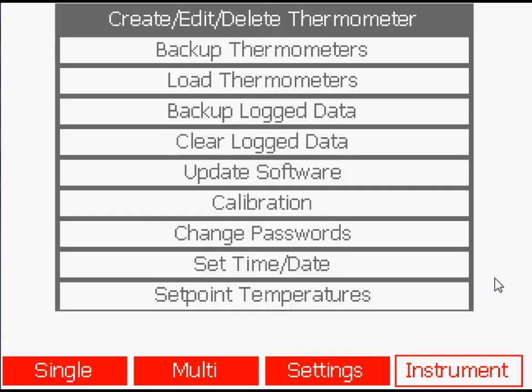Instrument. In the instrument window, you can access the Millicay's database of thermometers.